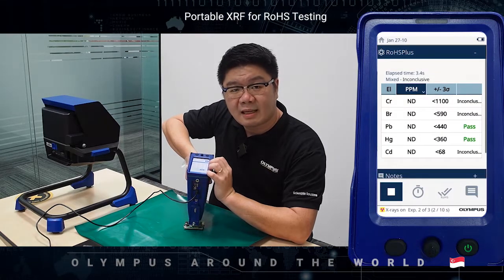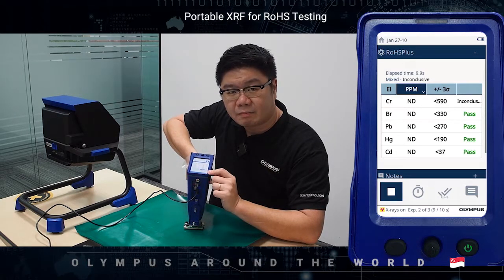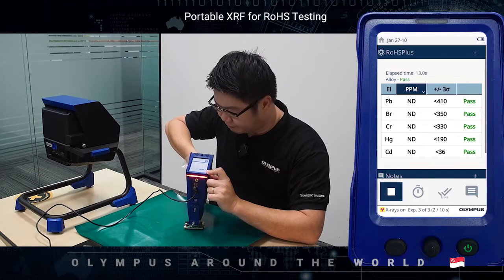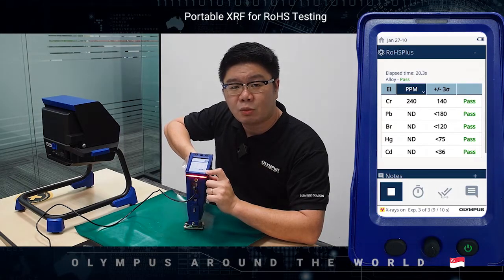Once the test has been initiated and the X-ray is emitting, there will be a red blinking light. Once the test has been completed, the blinking light will disappear. And in a matter of less than a minute, you will be able to get the result.